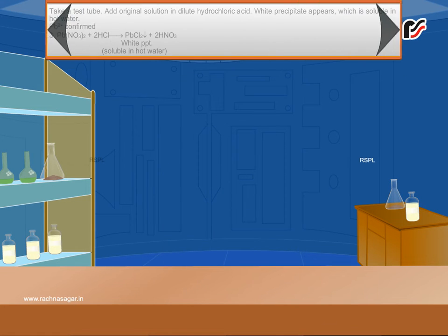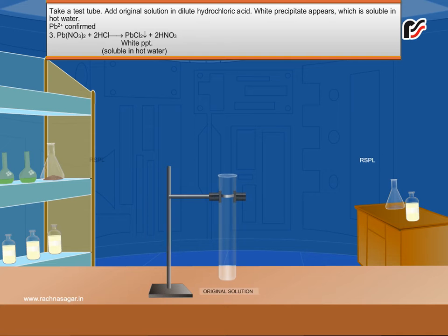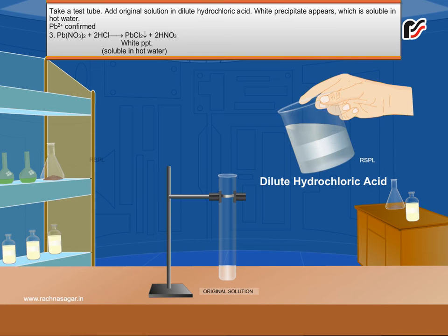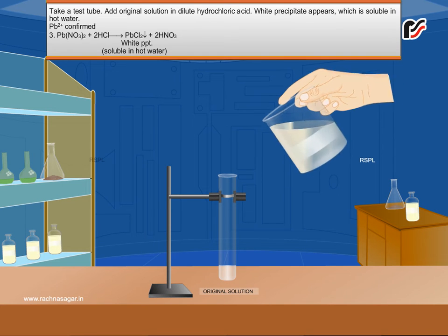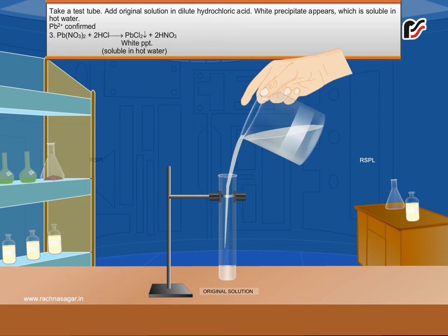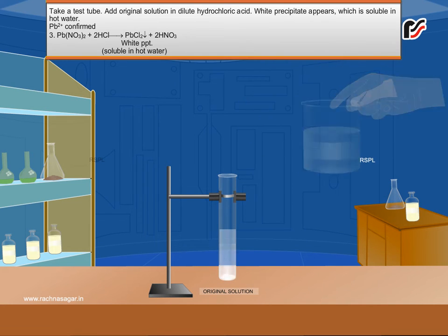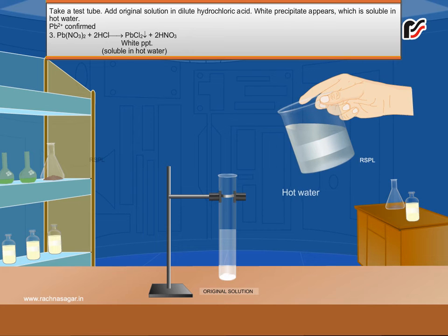Take a test tube and add the original solution in dilute hydrochloric acid. A white precipitate appears which is soluble in hot water. This is characteristic of lead chloride (PbCl₂), supporting identification of the Lead Ion.